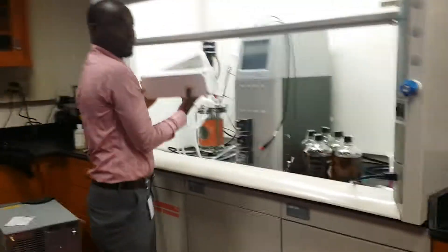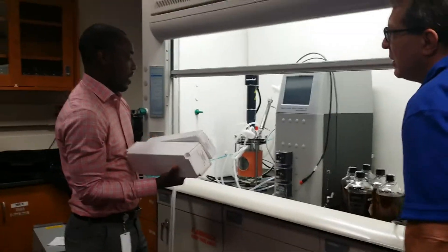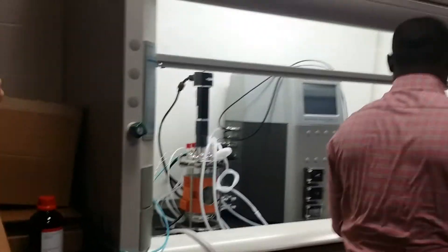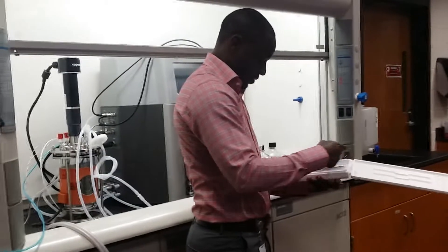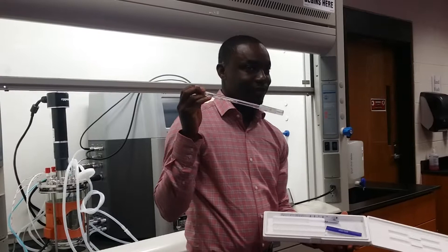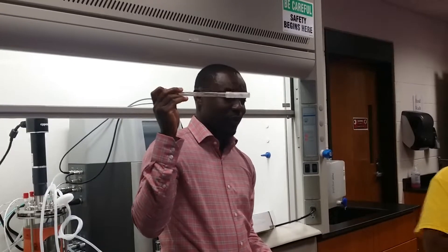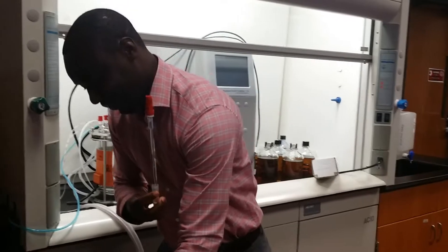How soon will we be writing for the autoclip? Anybody here use a pH probe before? What does it measure? Hydronium ion concentration. Why is it important? To maintain a safe environment for whatever you're growing.